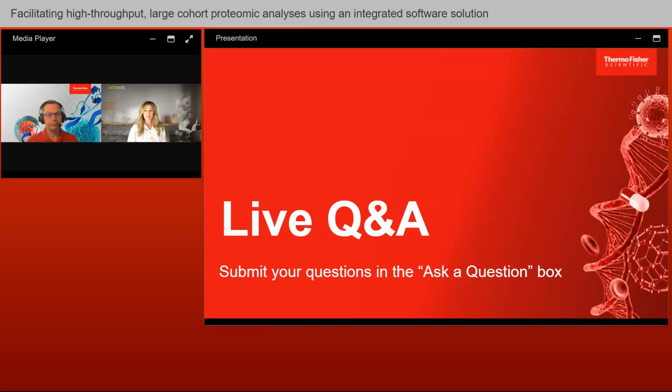So, David, we already have so many questions. I'm going to dive in. Let's just start with this one. In which version of PD is the DIA analysis implemented?